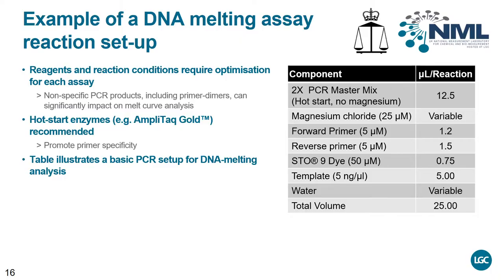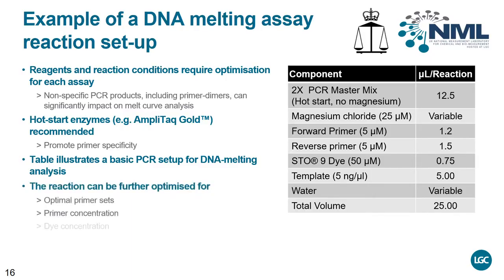The volumes depicted may be used for guidance when performing an optimization. Starting with the volumes and concentrations recommended, the reaction can be optimized beginning with primer set selection, primer concentrations, dye concentration, magnesium concentration, and finally, the amount of template employed.